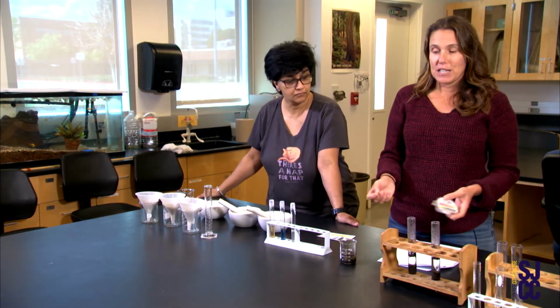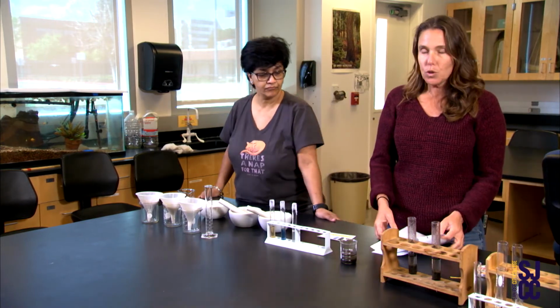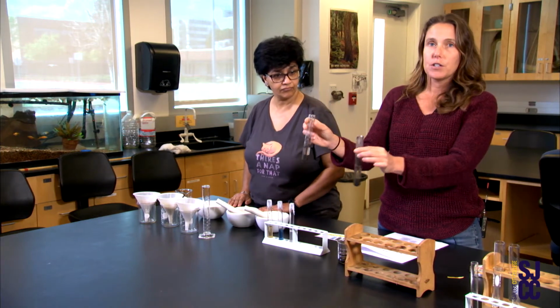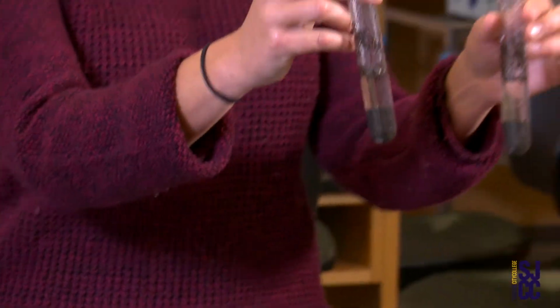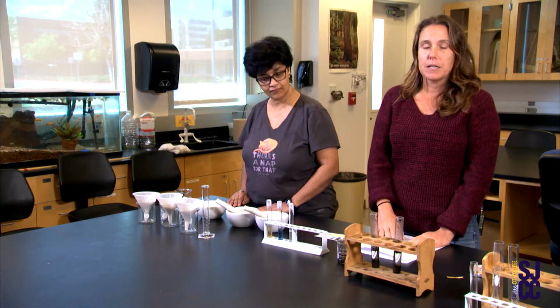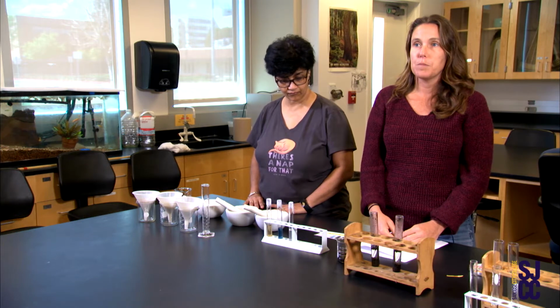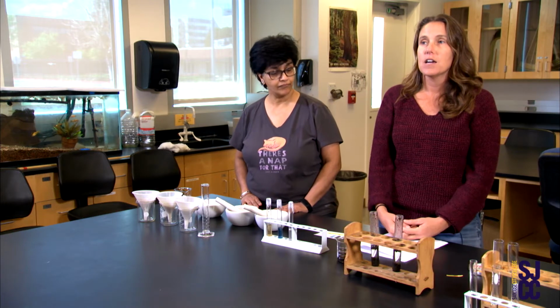The next chemistry experiment we're going to jump ahead to is our macronutrients, where again, we basically extracted using tablets. We put, again, 30 milliliters of distilled water with our soil, and we extracted the nutrients from the soil. And we're going to perform 3 different tests. In each of these tests, we use different tablets to extract some of the macronutrients, such as nitrogen, an important macronutrient that is really essential for plant growth and amino acids and development.